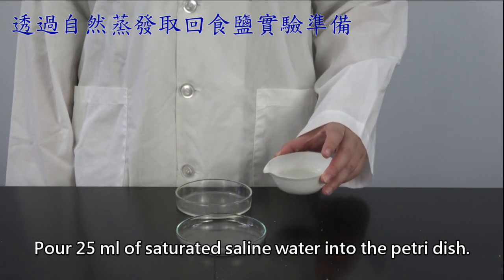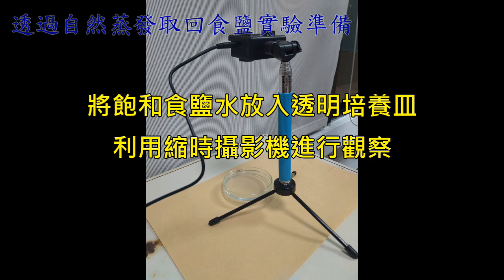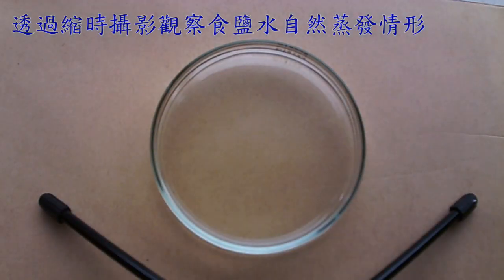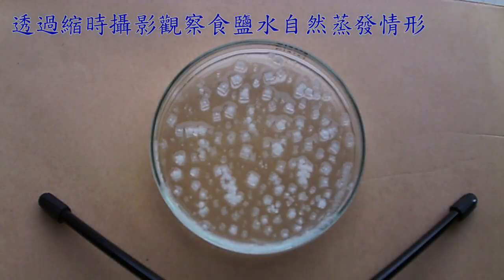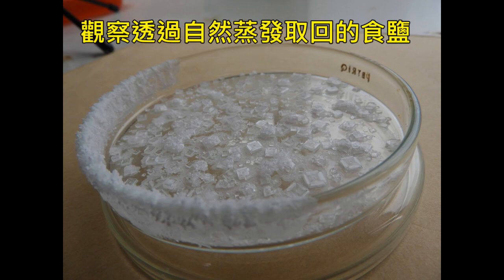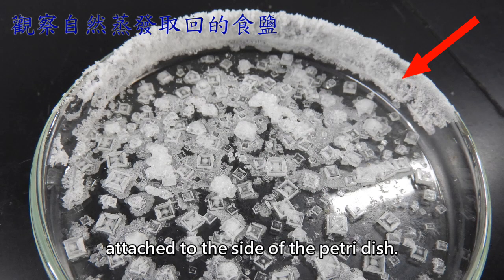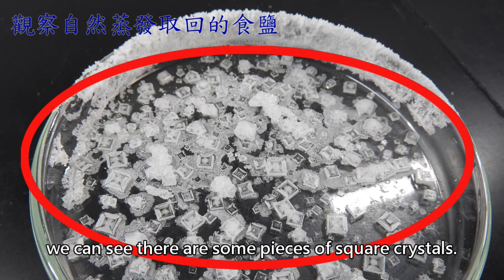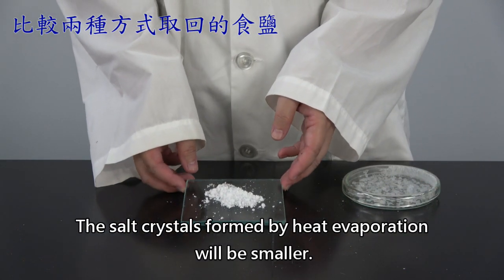Pour 25 ml of saturated saline water into the petri dish. We can see some white grains attached to the side of the petri dish, and at the bottom we can see pieces of square crystals. The salt crystals formed from spontaneous evaporation are bigger, while the salt crystals formed by heat evaporation will be smaller.